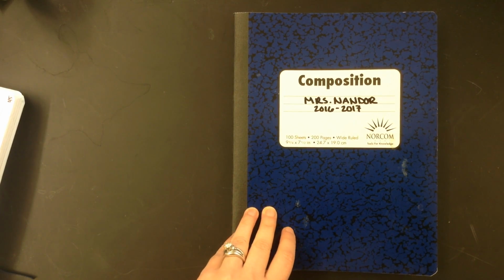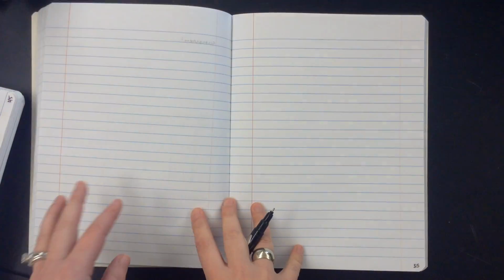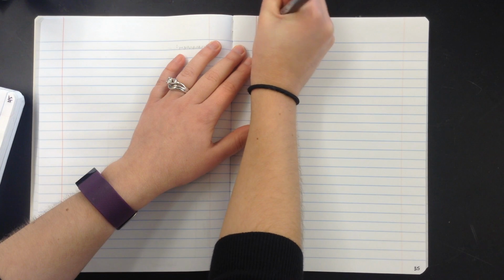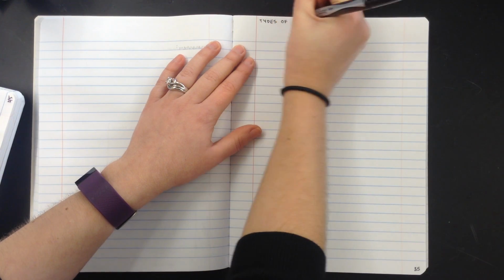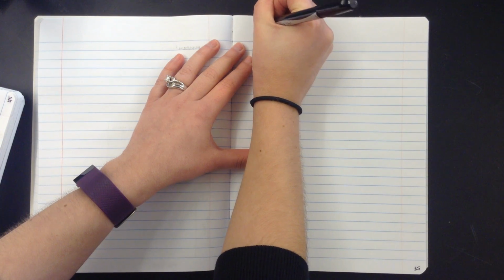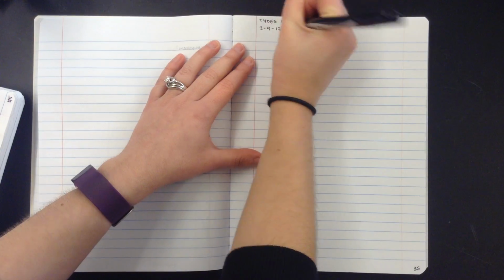So we're going to set up our lab notebooks for the types of bonds lab. The first thing I'm going to do is put my title in. So this is the types of bonds. And you're probably doing this on February 9th or 10th.